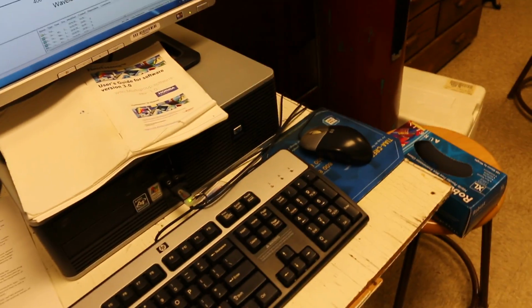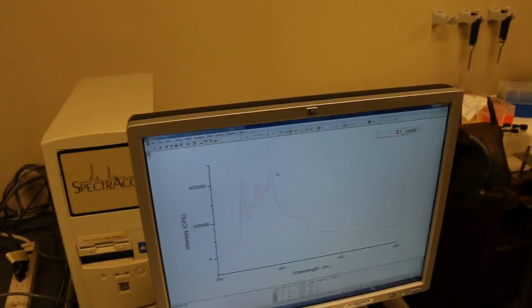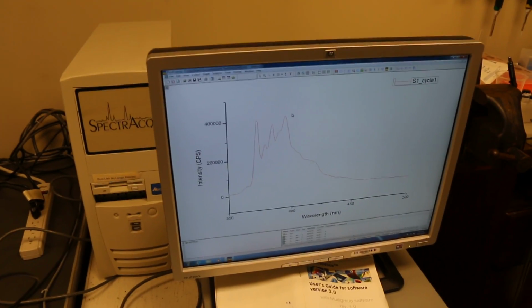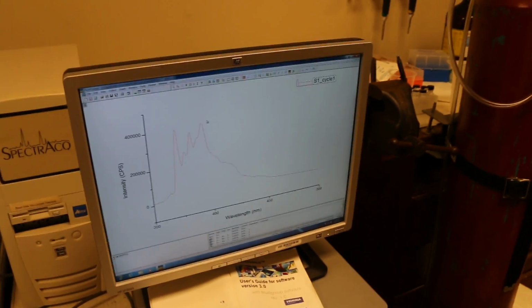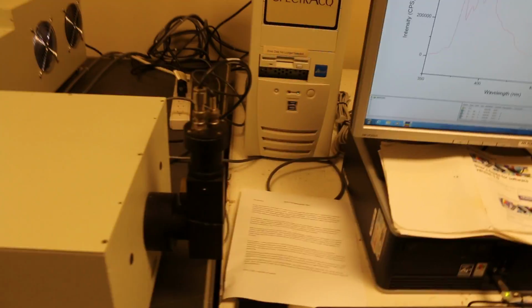And again, I don't have the samples of the protein here, but pyrene is a substrate for cytochromes P450 because all kinds of chemical compounds that you make or that you ingest, right, are metabolized by this suite of enzymes so that your body can eliminate them. So although a physicist, I'm trained as a biophysicist and also to some degree as a chemist.